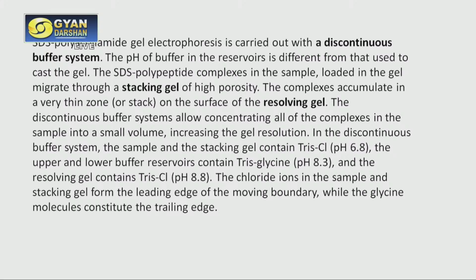And the stacking gel has a pH of 6.8, Tris-Cl pH 6.8. The upper and lower buffer reservoirs contain Tris-glycine pH 8.3. Resolving gel contains Tris-Cl pH 8.8. So you can see three different pH systems are present. That is why we call it a discontinuous buffer system.